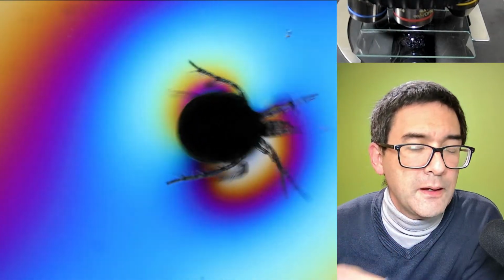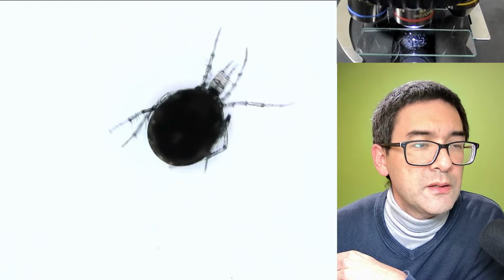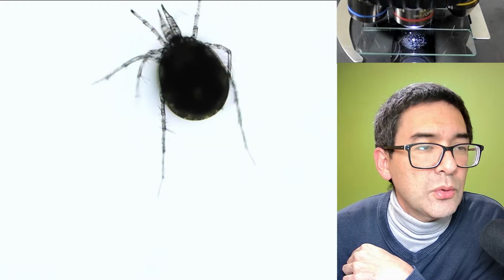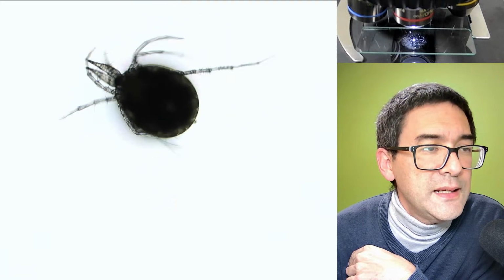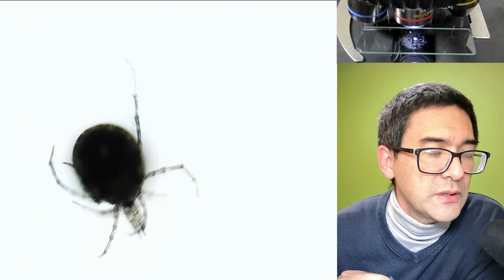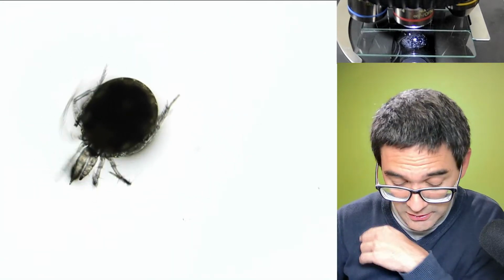Okay. Yeah, the rainbow colors are a little bit extreme. Let's put that away again. It's almost a little too fast. Insect or mite, we have to count the legs. Looks very much like a mite, of course, also the body shape. Yeah, and it's got 8 legs. Yeah. So okay, let's try it again.